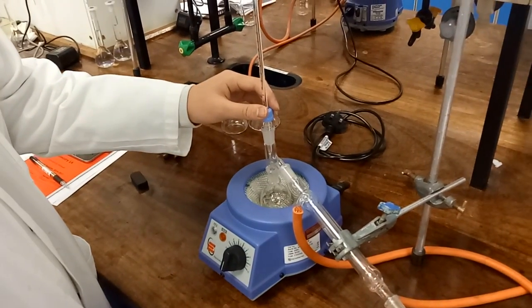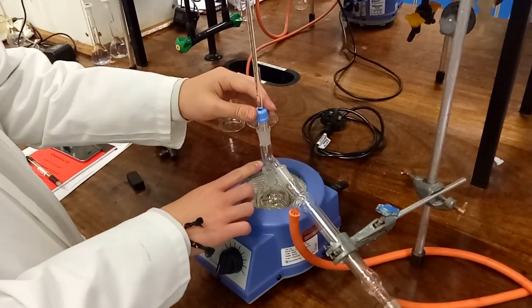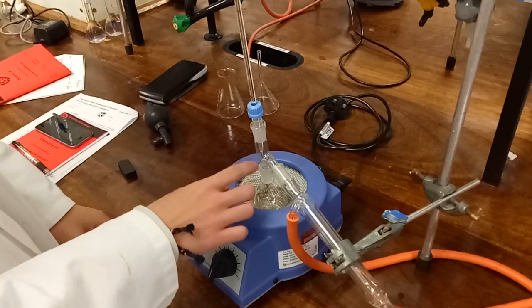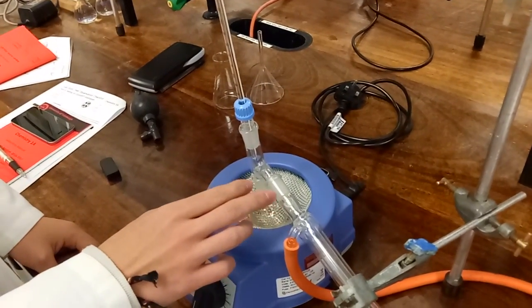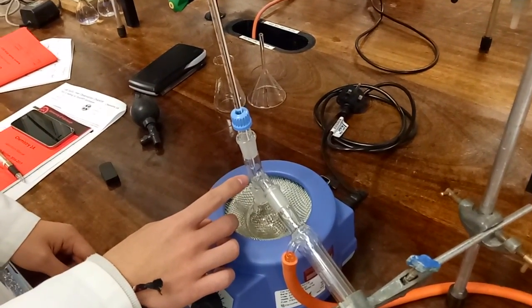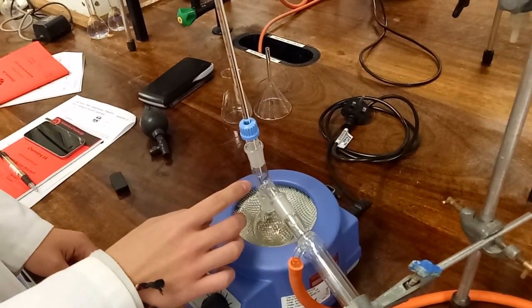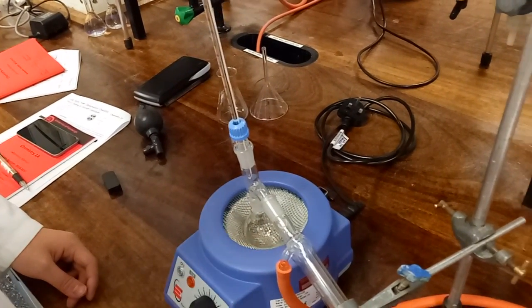The thermometer is held here at the joint between the flask and the condenser, because we want to measure the temperature of the gas as it goes into the condenser.